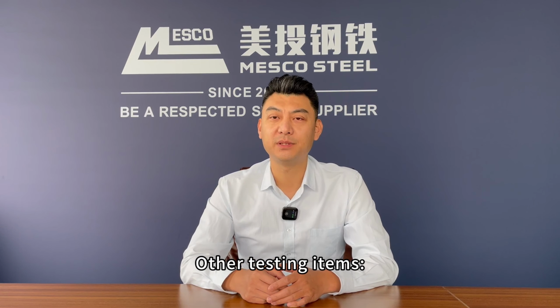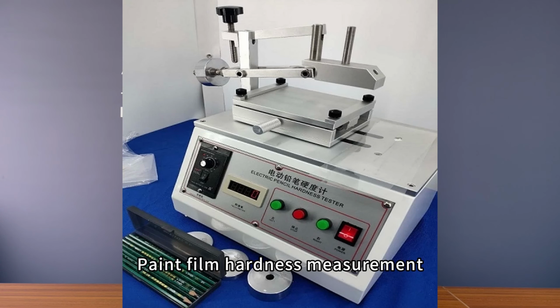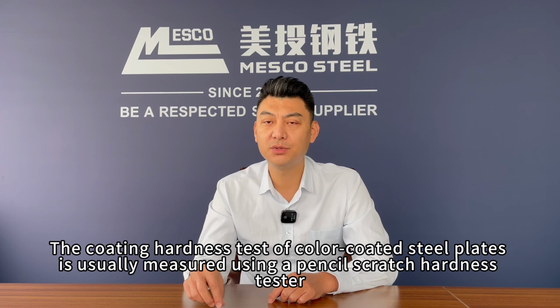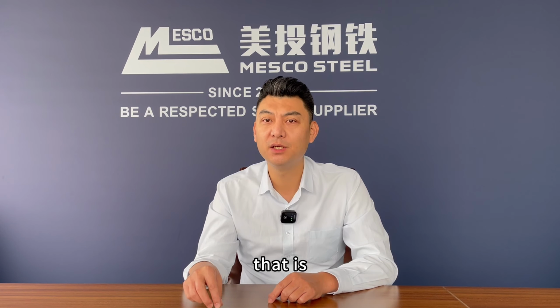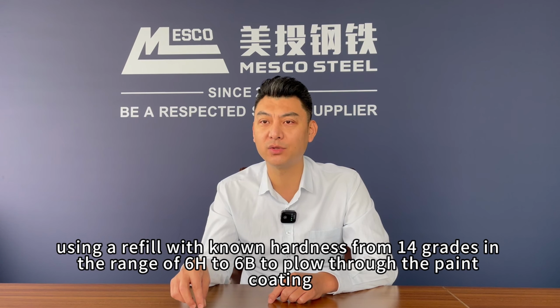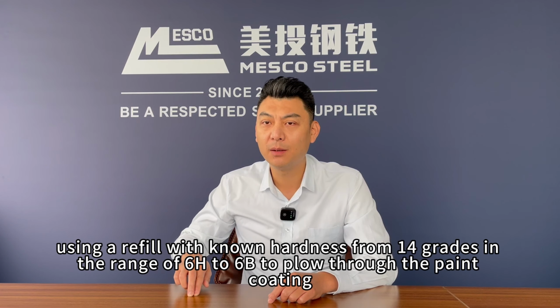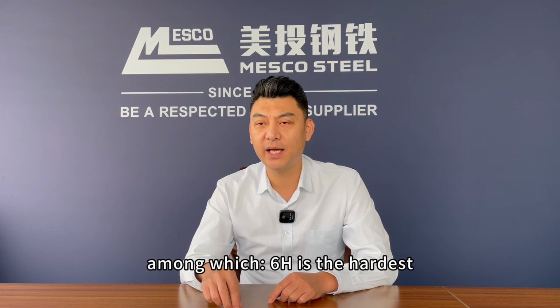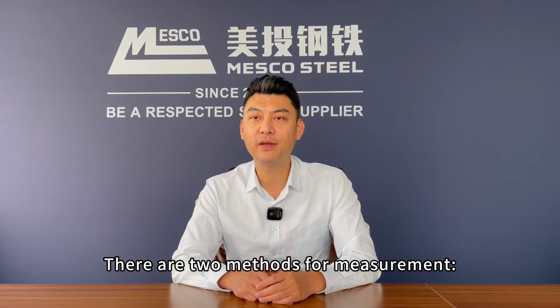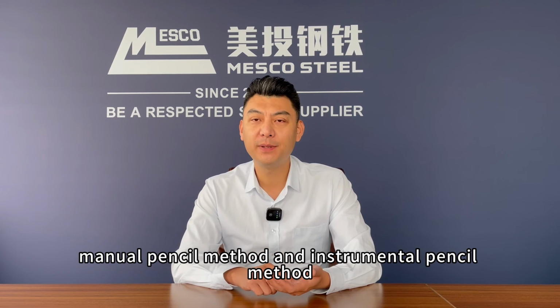Other testing items. Paint film hardness measurement. The coating hardness test of color-coated steel plates is usually measured using a pencil scratch hardness tester, that is, using a refill with known hardness from 14 grades in the range of 6H to 6B to plow through the paint coating, among which 6H is the hardest and 6B is the softest. There are two methods for measurement: manual pencil method and instrumental pencil method.